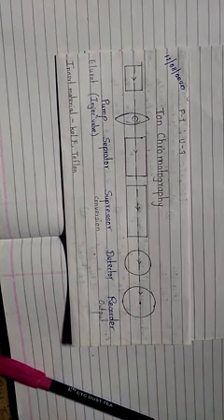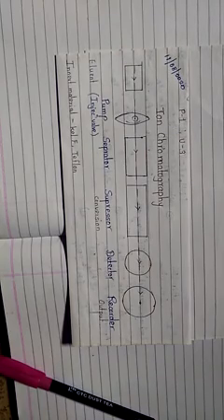In comparison, ion exchange chromatography, in spite of being a selective and versatile method of separation, and the analysis could be carried out by using spectrophotometry or polarographic technique.